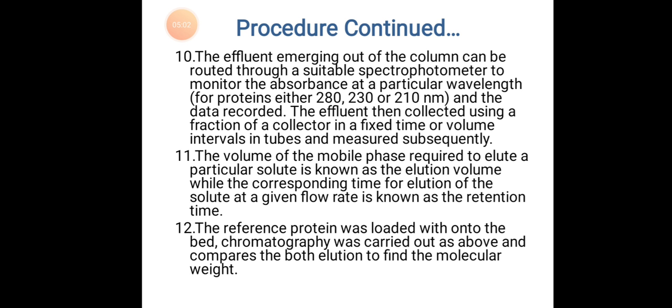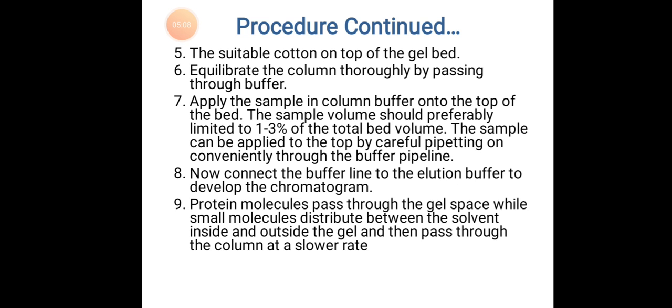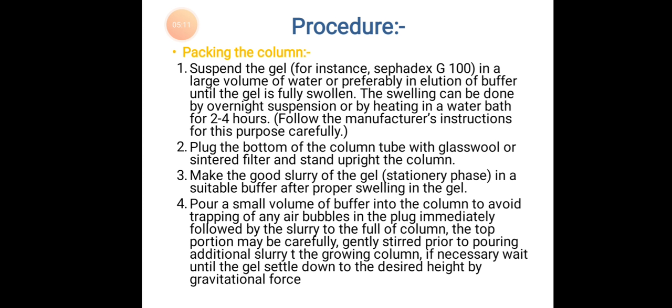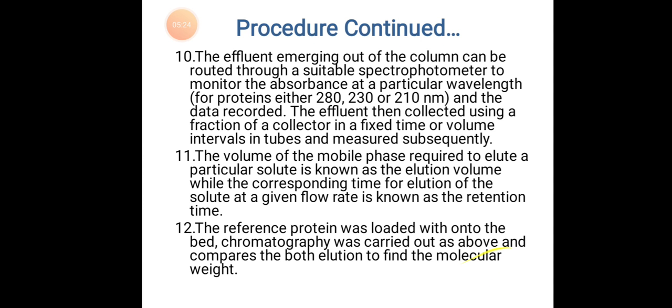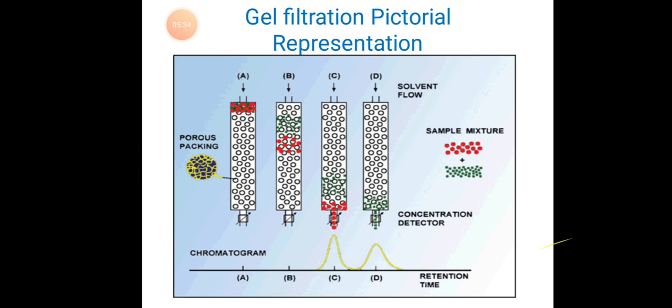The reference protein is loaded onto the bed. Chromatography is carried out as above. Compare both the elution volumes and find the molecular weight.